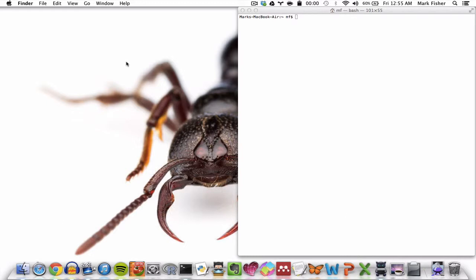Most Mac OS X operating systems come with Python pre-installed, but links for Python, R, and gfast, all of which are freeware, are provided again in the user's manual, although a version of gfast is included in the HeFPipe installation material. So I'm going to assume for the sake of this module that you've installed R and Python, but you'll also have to install a number of packages for both of them.